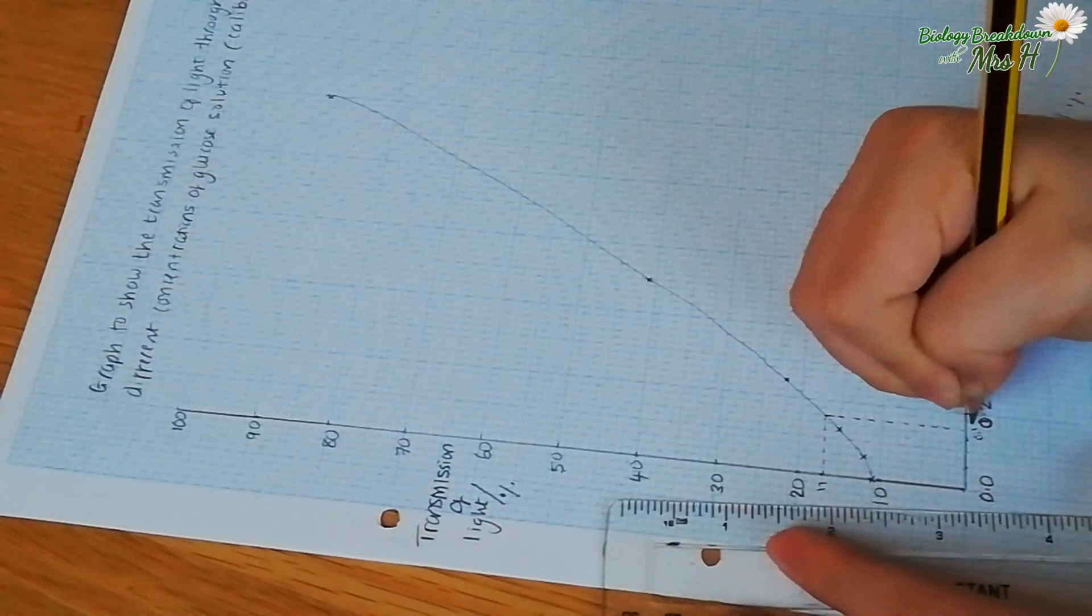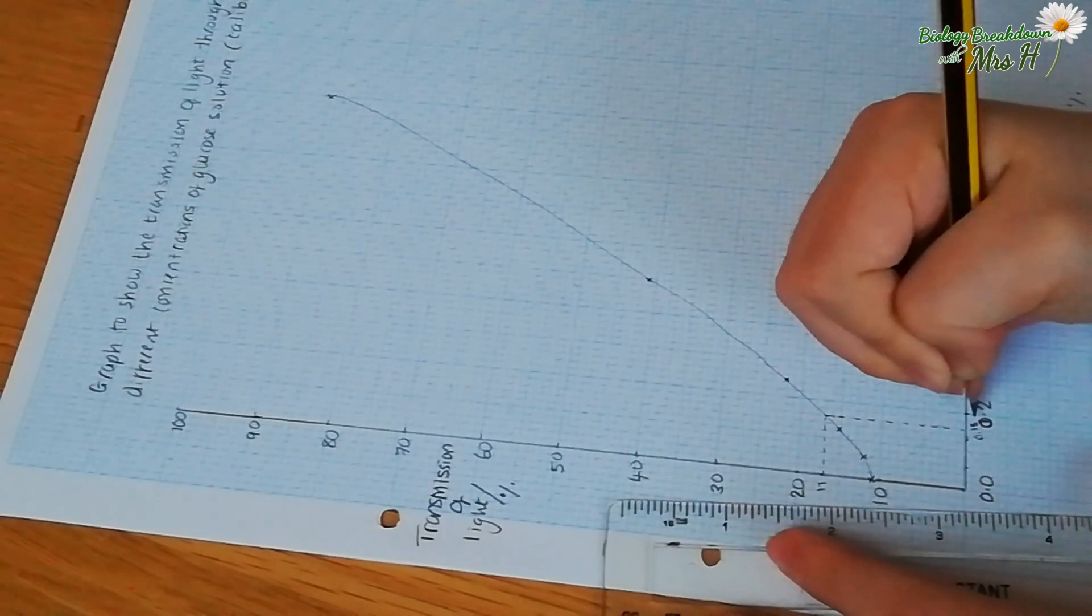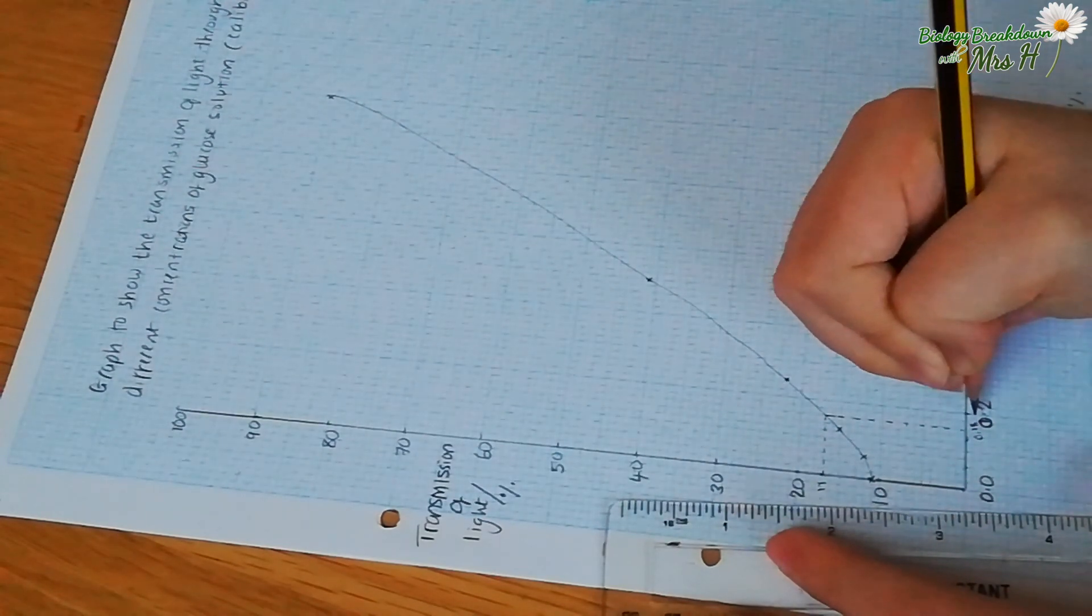This curve shows that the concentration of the unknown solution was 0.16%.